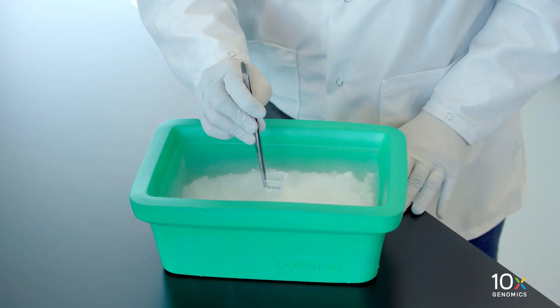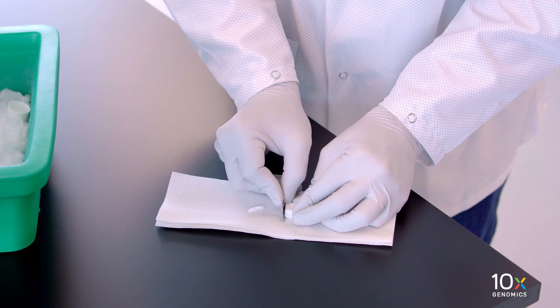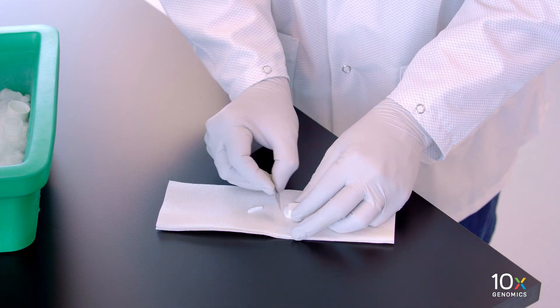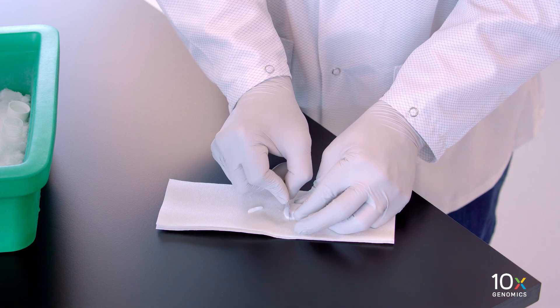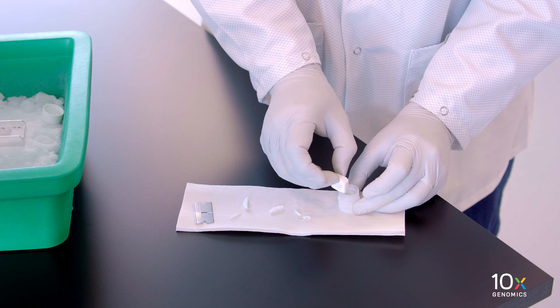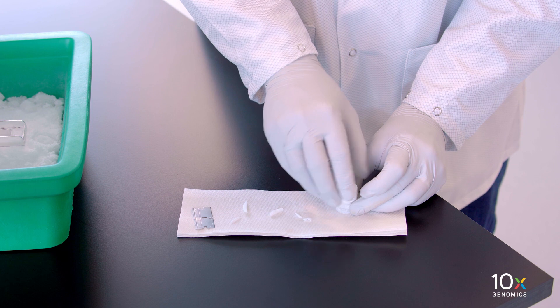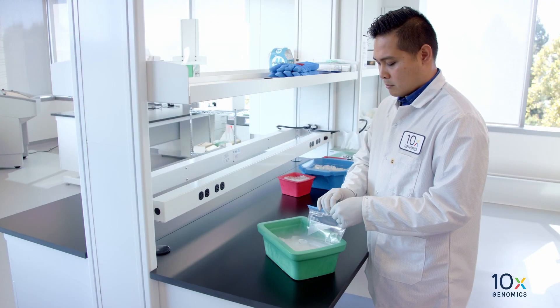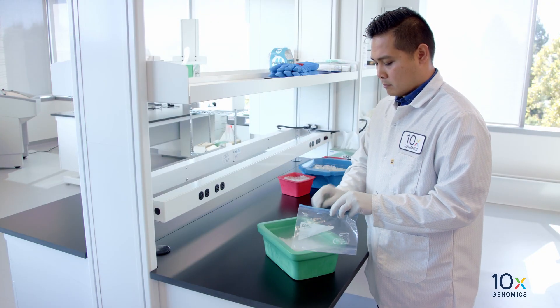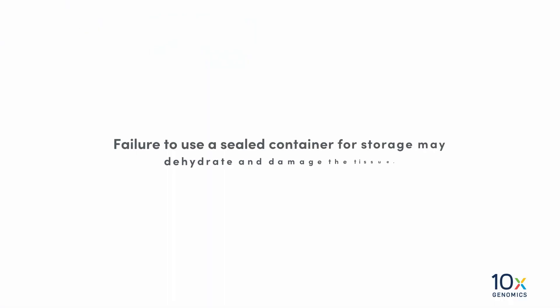Once frozen, place the cryomold on powdered dry ice. Remove the tissue block from the cryomold and trim it using a razor blade. Then place the OCT embedded tissue block into a pre-cooled Wheaton Cryolead cryovial. Alternatively, a resealable bag can be used for storing the tissue block. Failure to use a sealed container for storage may dehydrate and damage the tissue.